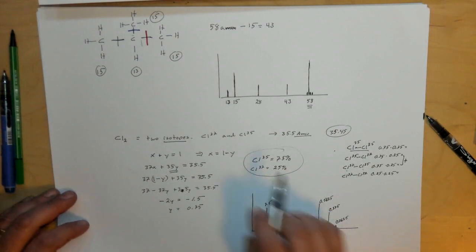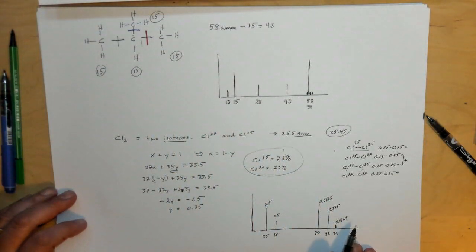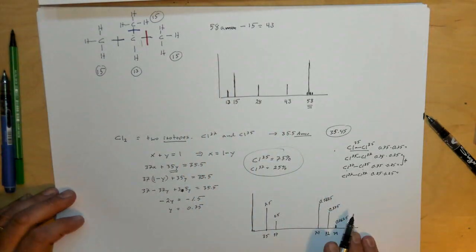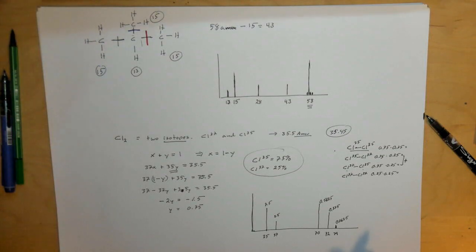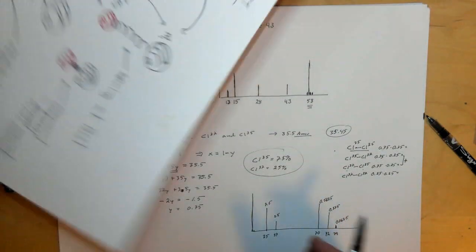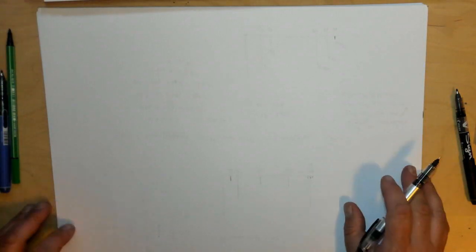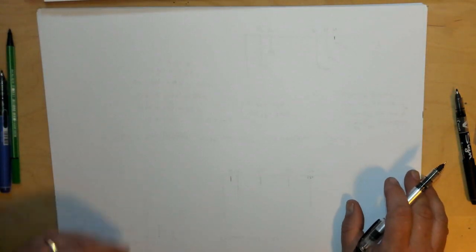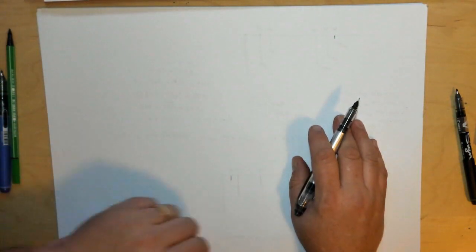So this is an example of two examples of what you can do with a mass spectrometer, and to make them work. So I'm going to leave that topic and then move on, but this is something that you can work on in other examples later on. So then I'm going to leave the mass part, and now we're going to move on to looking at molecular structure. Now we looked at the masses and we saw that we could break it up and see the different parts in masses. Now let's look at what you can do with the structure.